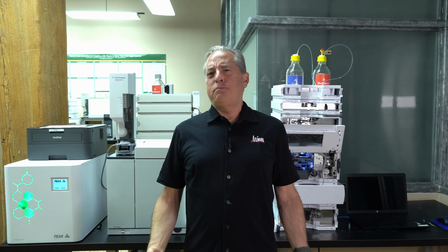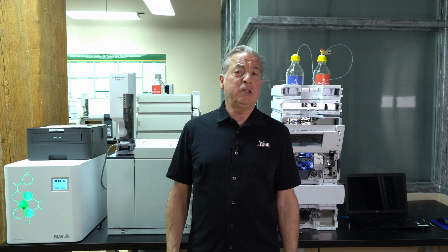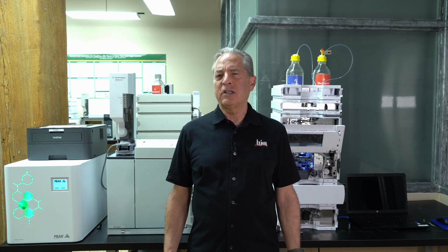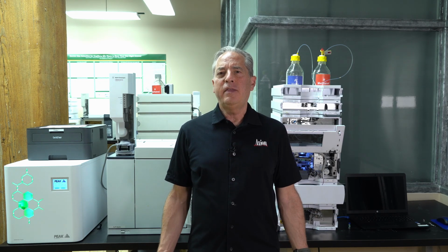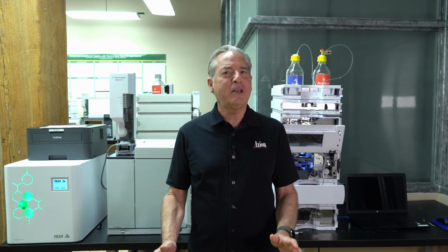One added part to that answer is, if you're working in a pharmaceutical company, you're working with a lot of HPLCs, and in that world, you probably want to do preventive maintenance every 6 months. I call this muscle flexing: you want to prove to the FDA that you care so much about quality that you're willing to spend extra money to make sure you don't have a problem, which is a good place to be.